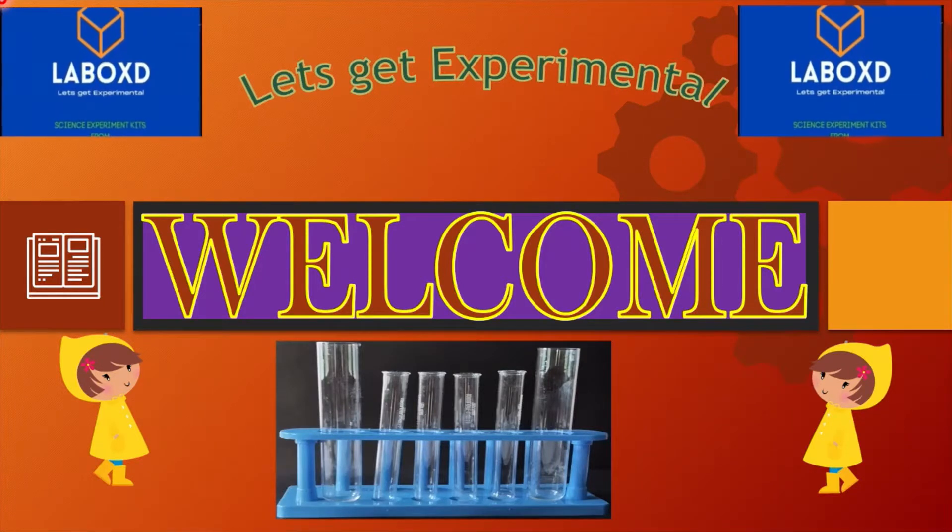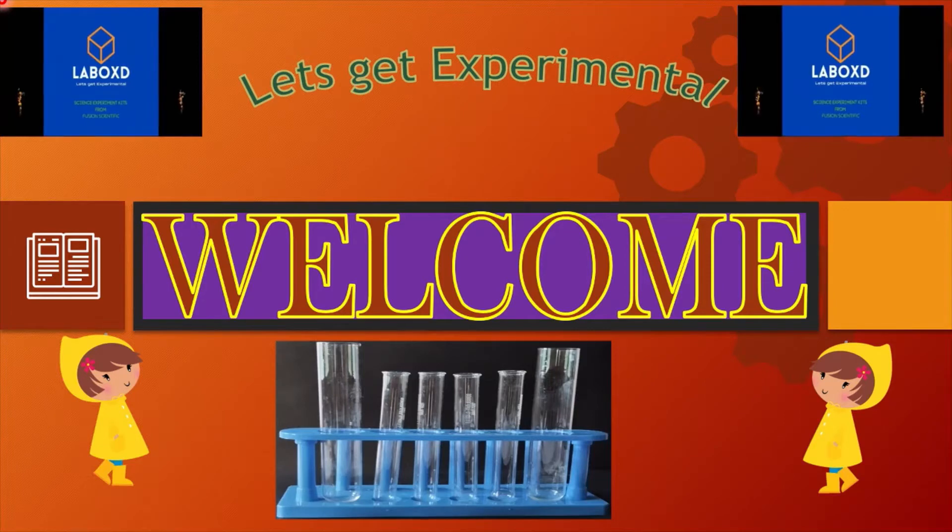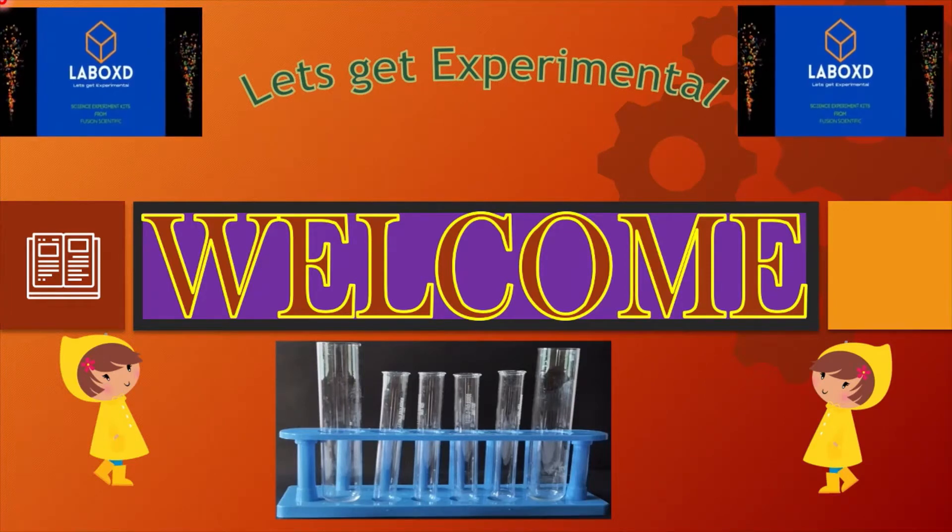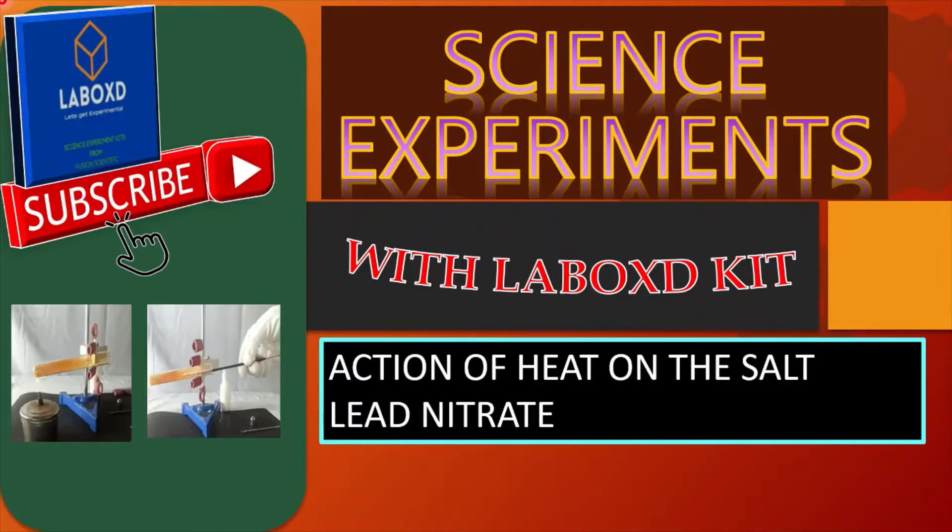Science is a wonderful subject which always keeps us thinking. Today, we will demonstrate the action of heat on the salt lead nitrate.